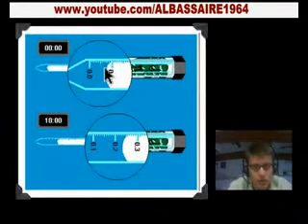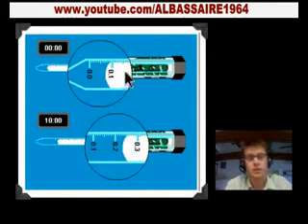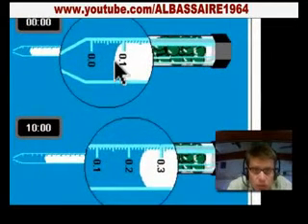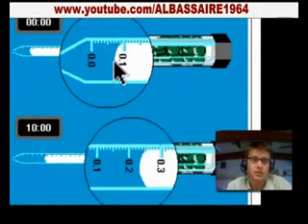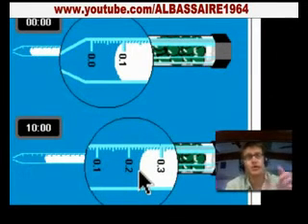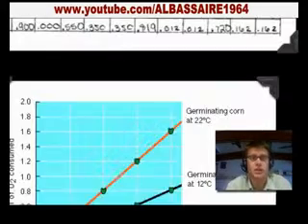On this diagram right here, this would actually be the water that's flowing into the respirometer in the blue, and then this white area is going to be the air bubble, and that air bubble extends all the way into the respirometer. And so right here we can read the meniscus at the bottom. So if this is 0 and this is 0.1 milliliters, it would actually be at this point at 0.07 milliliters. And then as it flows in, we could read it up here, and it looks like it's at 0.22 milliliters. And so we could find the difference between that over a given period of time, and it's going to tell us how much of the oxygen was actually consumed.